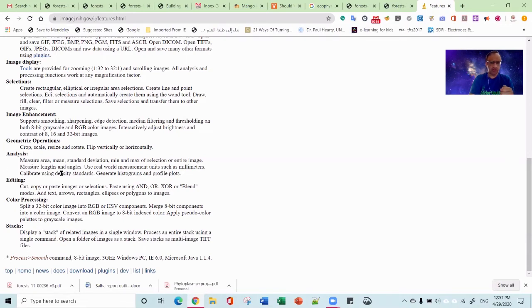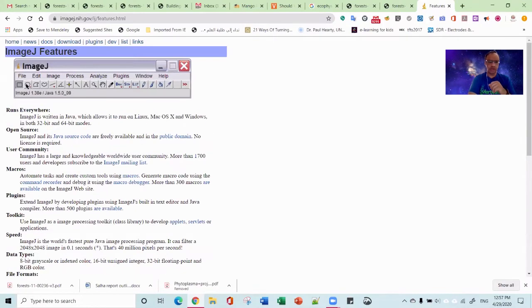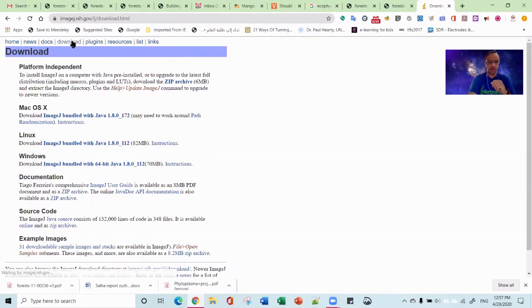It also allows you to do some statistical analysis that can be downloaded to Excel, and in due time we'll get to that in detail, because I'm going to prepare a short video for each of the uses that I'm interested in, and you might be as well. That will be later. For today, we'll just show you the software and show you where to download it depending on your system.